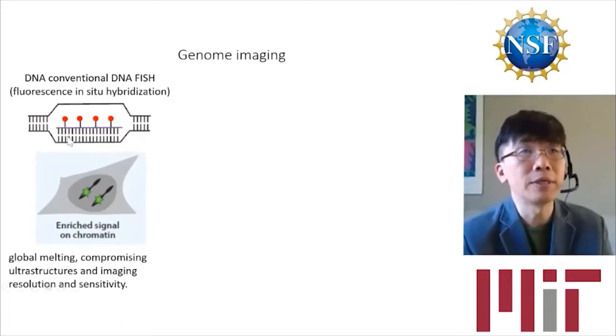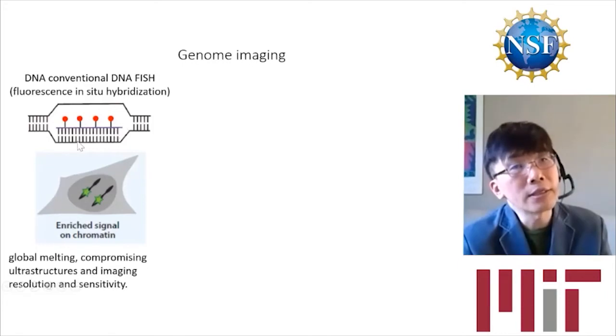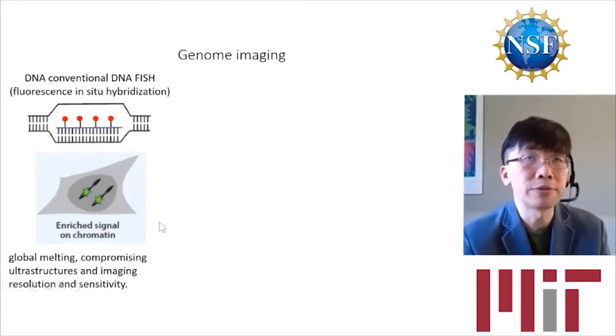And then we anneal labeled oligos to bind to the target strand to label the genomic loci. But the global melting potentially compromises ultrastructures in the genome. And because all of the DNA is melted, you also have a lot of non-specific annealing of the probes, reducing sensitivity and potentially imaging resolution.